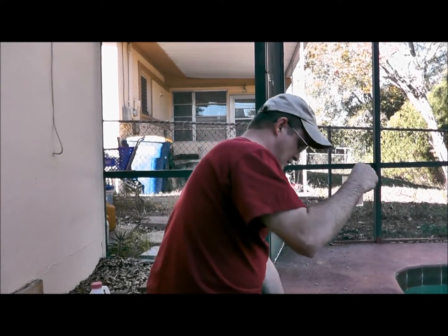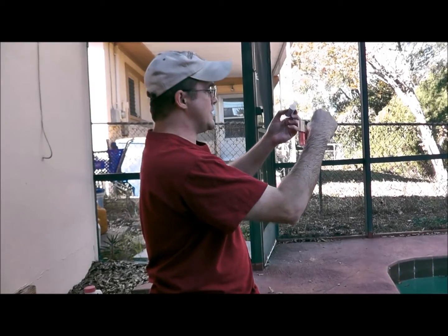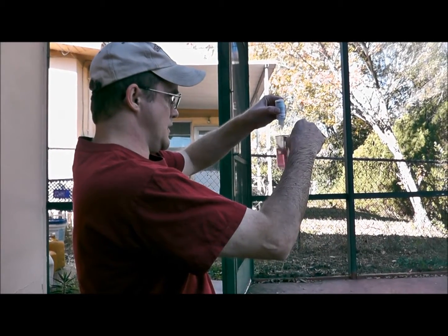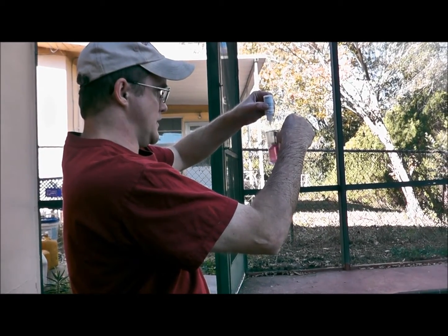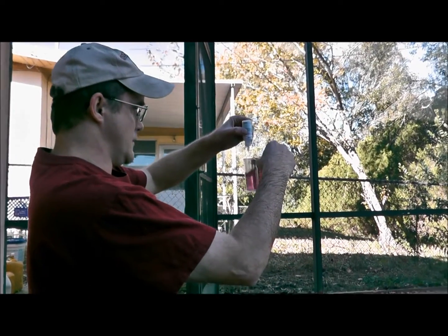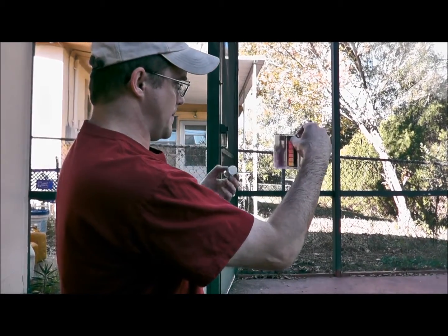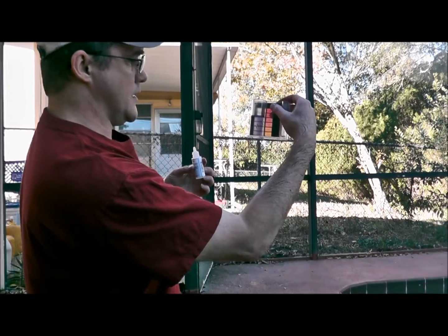The next one is the hardness reagent. This is going to change the color of the solution — it starts pink and will turn blue. Hold the vial at eye level — always at eye level — and start adding drops while counting. Keep adding until the solution fully changes from pink to blue. In this case it took 31 drops to get a nice blue color.